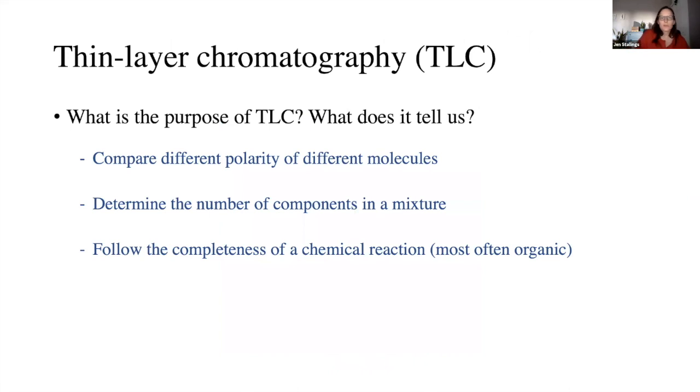Okay, so the purpose of TLC, we're comparing different polarities. We're determining how many components are in a mixture. So TLC can separate out different components that are in a mixture. And we can also monitor if a reaction is taking place or at what point the reaction's at.